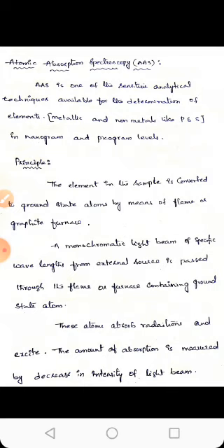These atoms absorb radiation and get excited. So when we pass the light, those atoms absorb that light and go to the excited state.